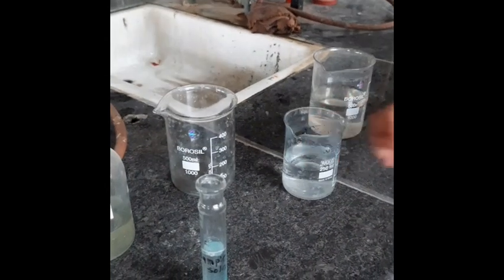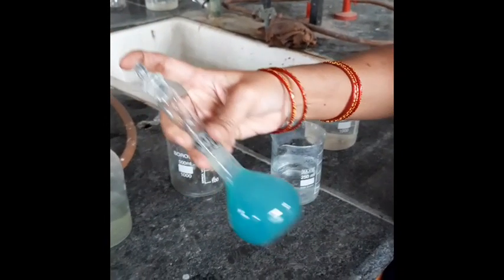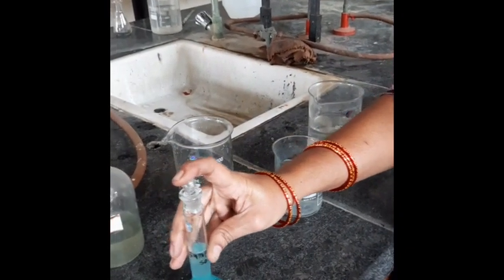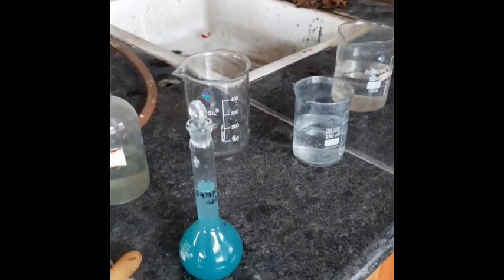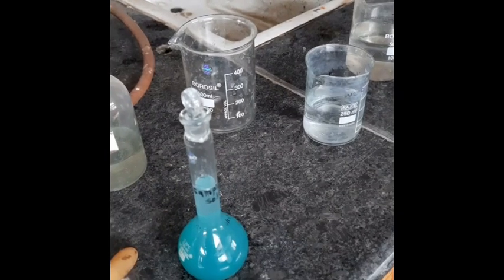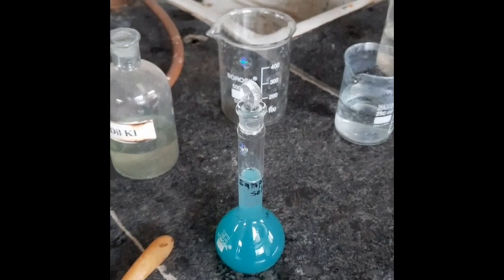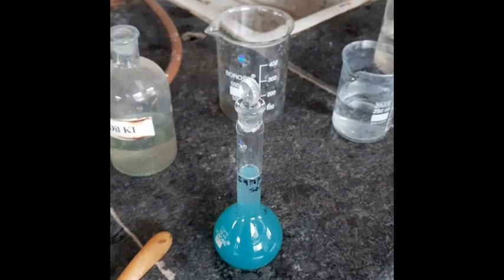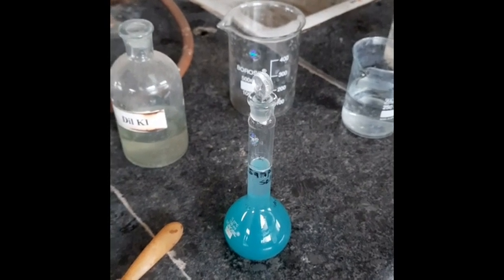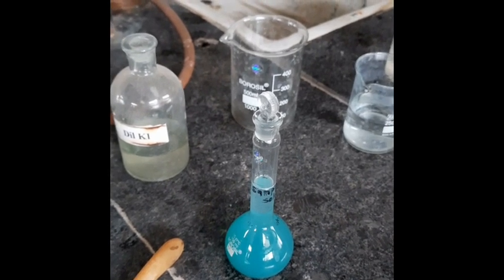Okay, now stopper the volumetric flask and shake it. Here your sample solution, that is ore solution, is ready. Copper ore solution is ready. Here 100 ml copper solution is prepared, in which 1 gram of copper ore is taken. So this solution we are going to use for part B, that is determination of percentage of copper.